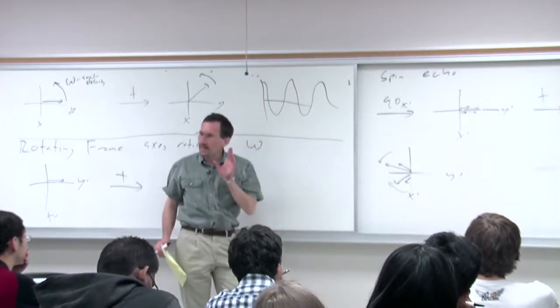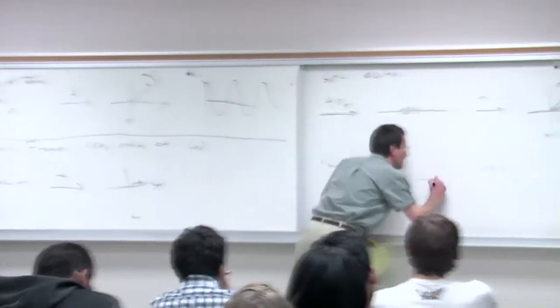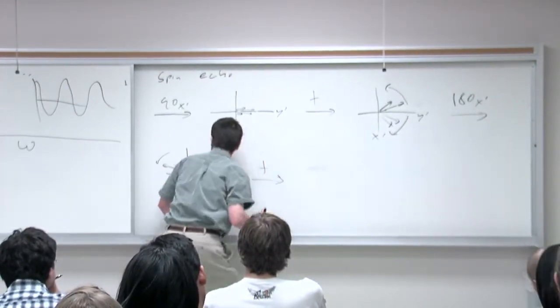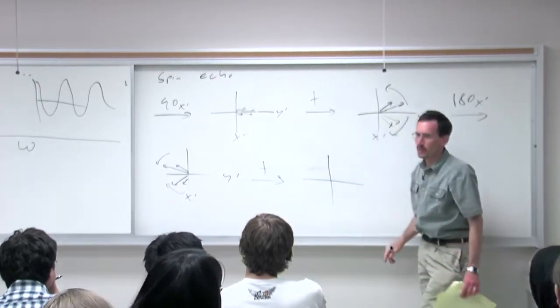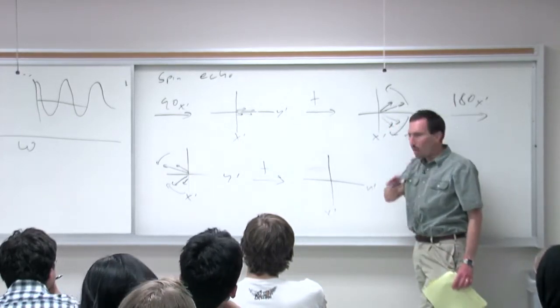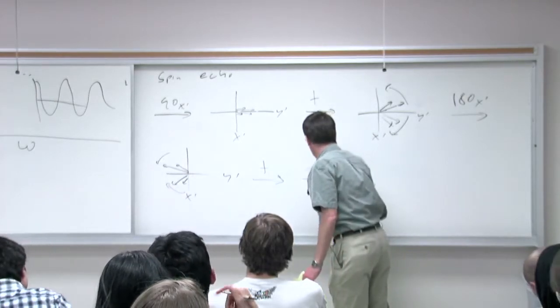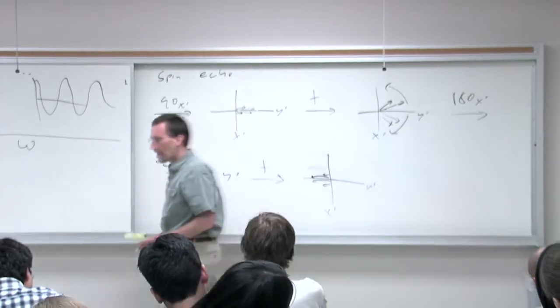And if we wait another time t, that same time increment, what's our picture at this point? They're all on the negative y-axis, like so.